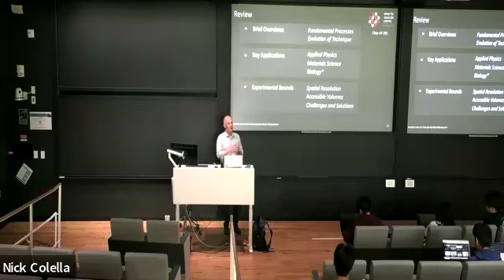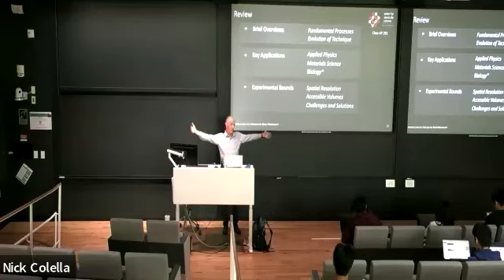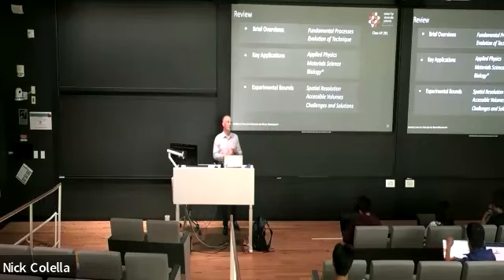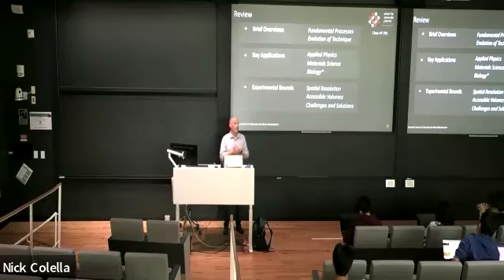These are parameters that you can play with. If necessary, you can make the voxels a little bigger, and then correspondingly you can access larger volumes. So there are a few parameters that you can play with: the dwell time, how long you stay on one pixel, and the pixel step size. In the end you always have to optimize those parameters for your specific application.